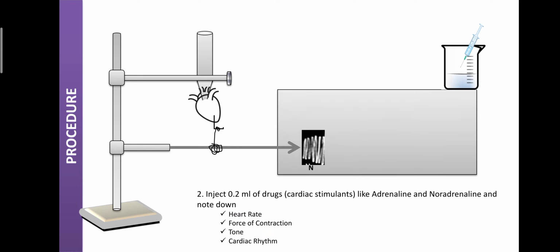Then inject 0.2 ml of a drug belonging to the cardiac stimulants. Cardiac stimulants are those drugs having the capability to enhance the performance and functions of the heart.